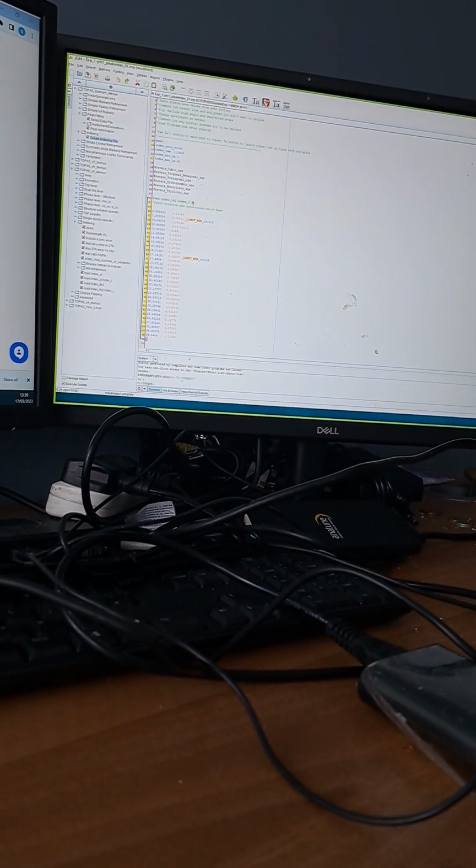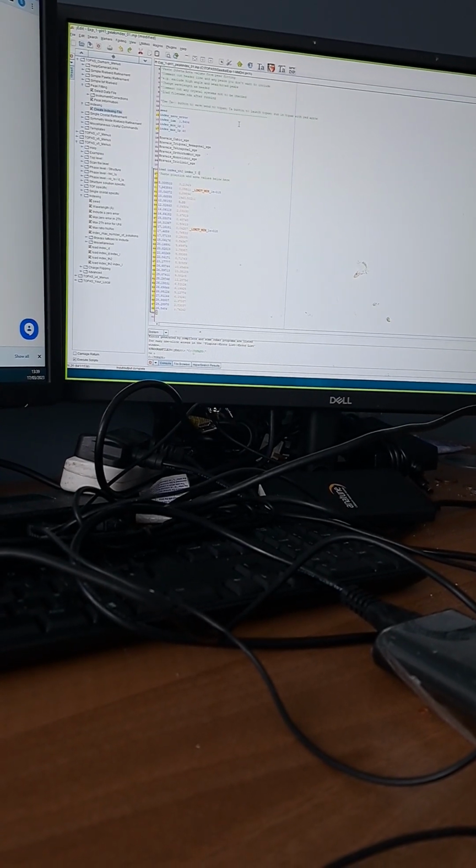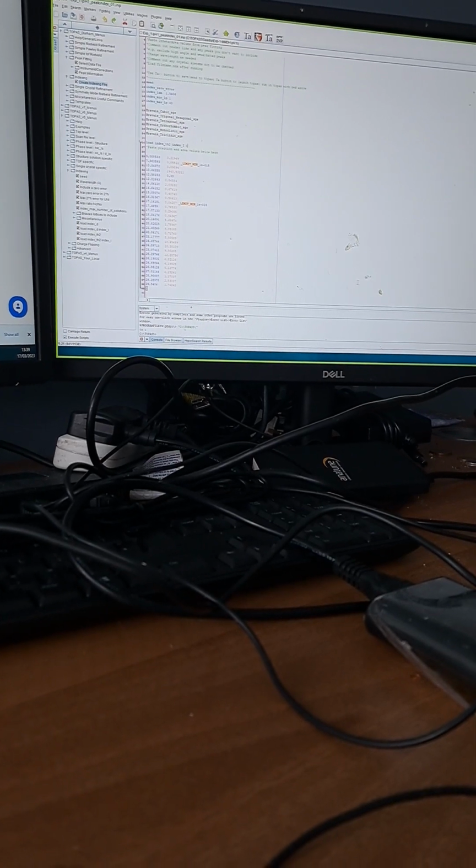And then what you're looking for, you're looking through these six crystal systems. Yes, I'm missing one, but it doesn't really matter. Okay, in here then, between these two brackets and this one down here, we've got our values. Now what we can do is send that on to Topaz.